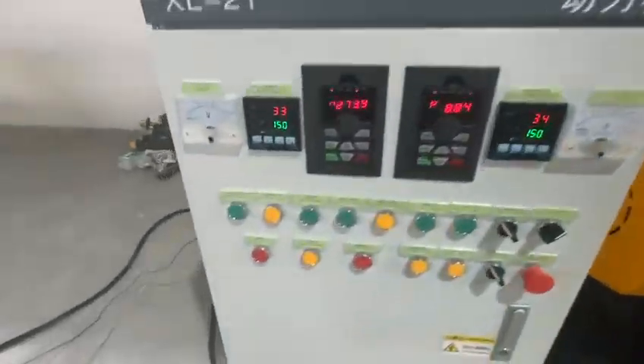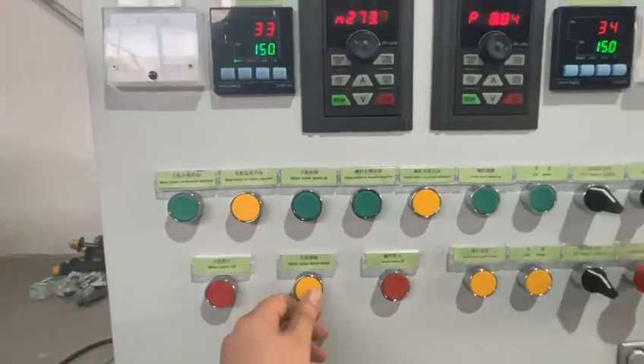We can see through this window the double Sigma blades rotating in the forward direction, and the screw is rotating in the discharging direction. We can also control the speed right here — speed up, speed down.